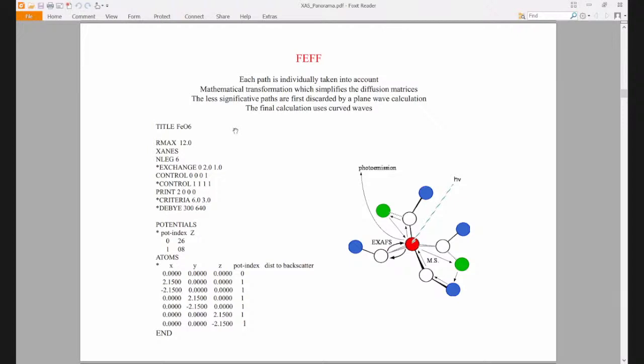It's a series, multiple scattering is a series in terms of mathematics, with order zero, order one, order two, and so on, and the terms are more and more decreased. Actually, it was a problem at the beginning, because for a while the people were thinking, okay, it's a series, but it's not a mathematical series. Nobody knows exactly if the series converges. You don't know if after some while, one term will be again with some amplitude which is not negligible compared to the others. And this is a little bit true.